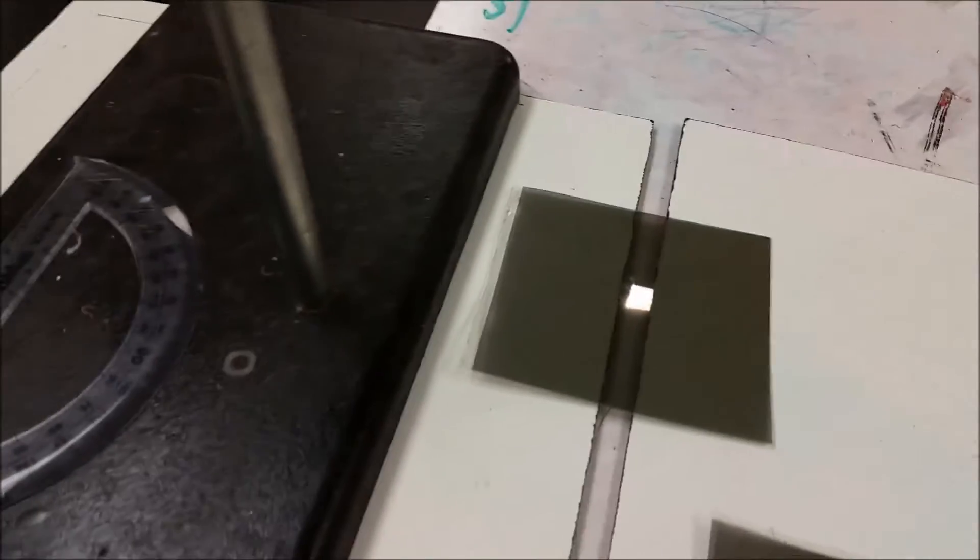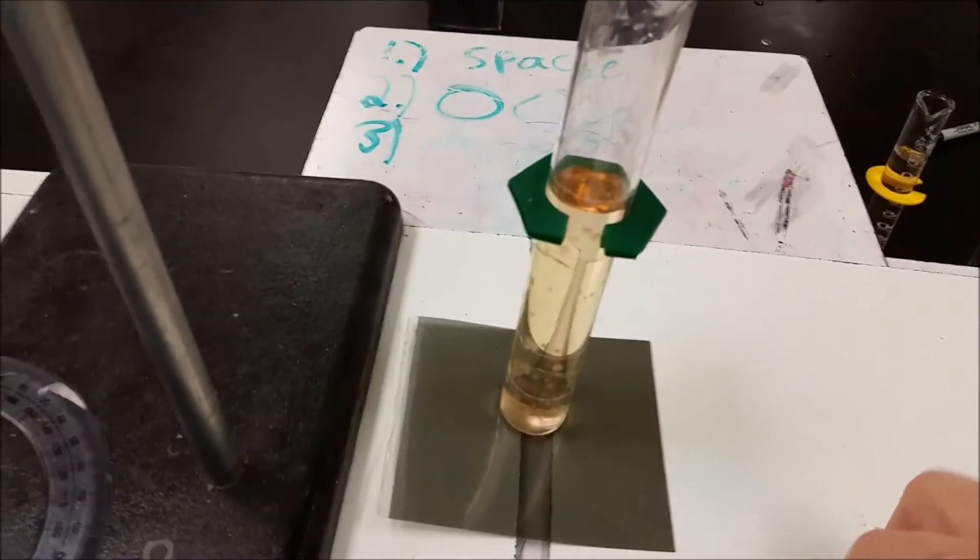So if we take the 20% and set that on there, now when I hold this at 90 degrees, it's letting more light through, and in order for me to block out that light, I need to rotate it slightly so that it becomes darker.